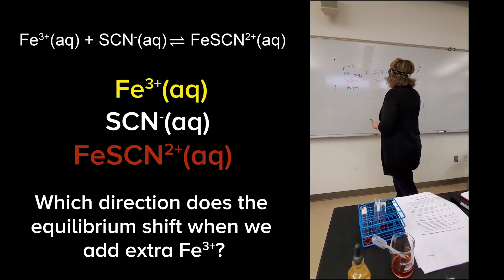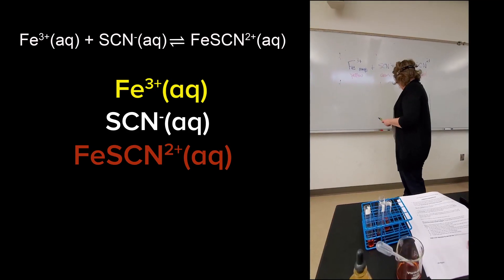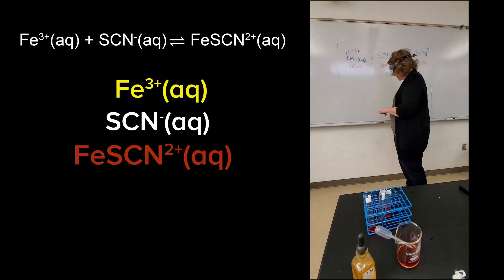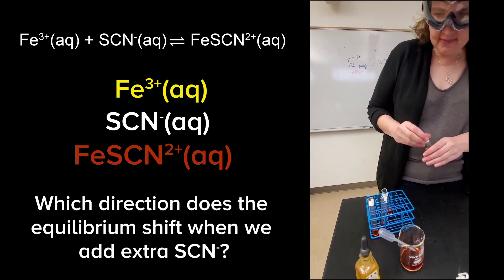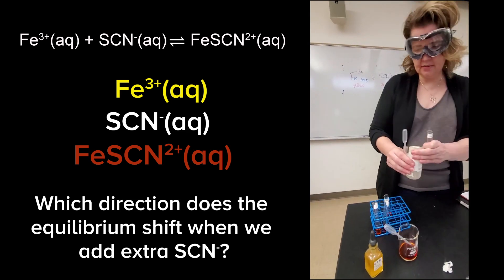Okay. Now, in the next part, we are going to add a little excess. What are we adding? This time we're adding 10 drops of the thiocyanate. Okay. So that's the clear one.